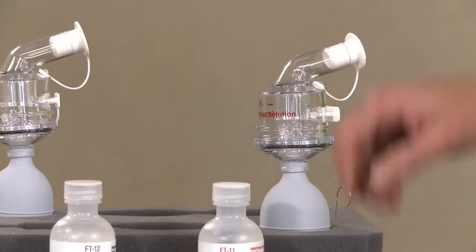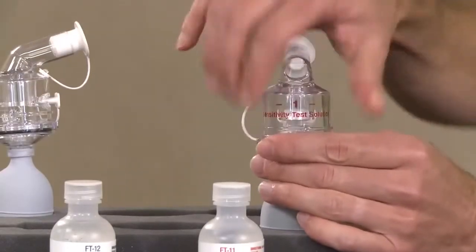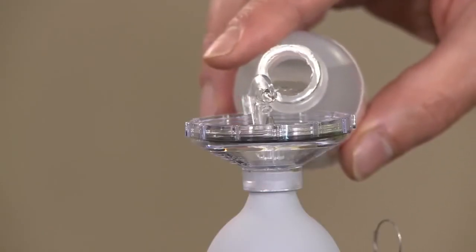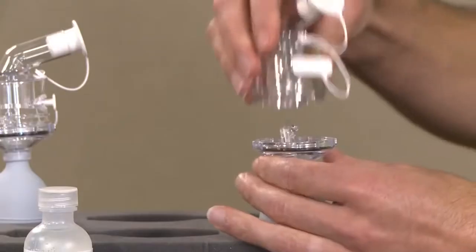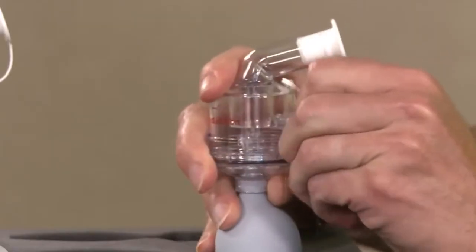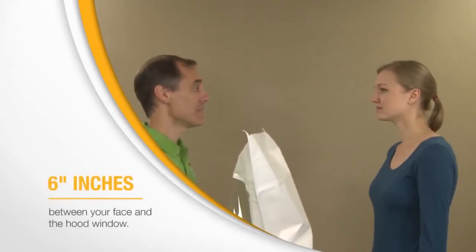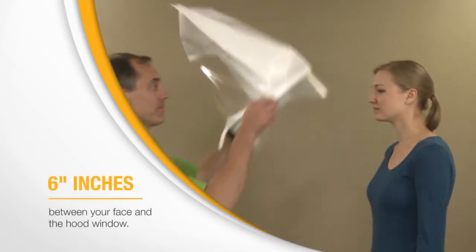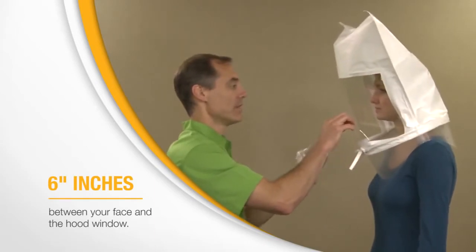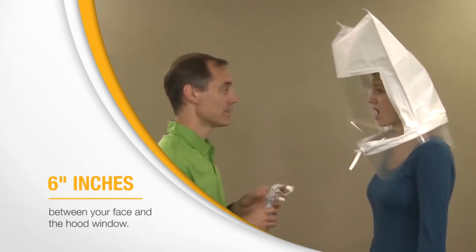The first step is a sensitivity check. It establishes your ability to taste the test agent. You don't wear your respirator for this step. Your instructor will place a hood over your head. It should be positioned so that there is a space of about 6 inches between your face and the hood window. This allows free movement of your head.